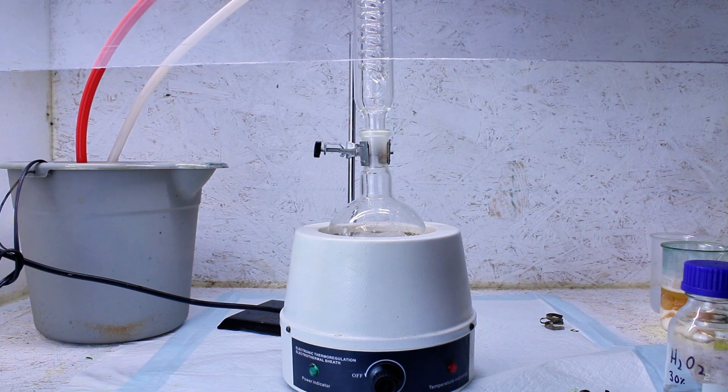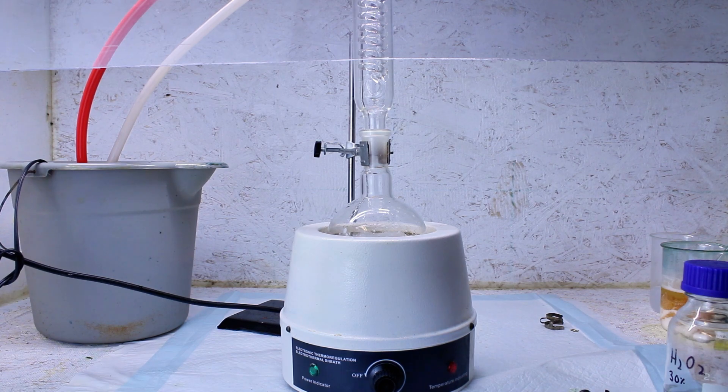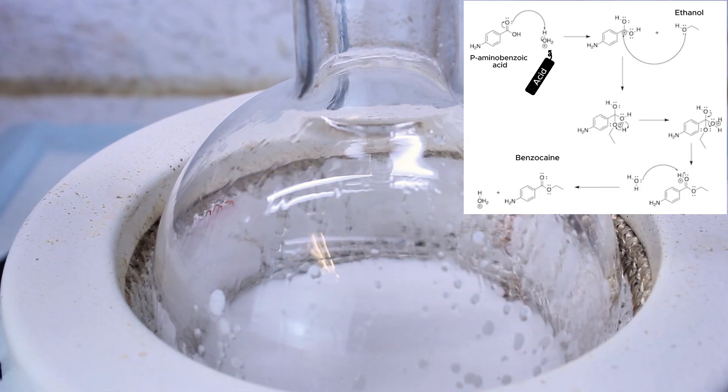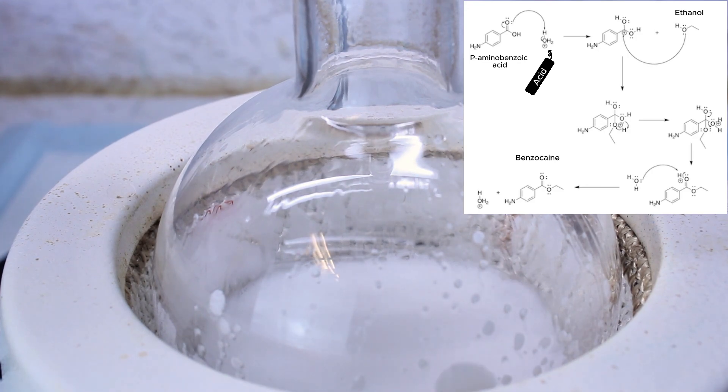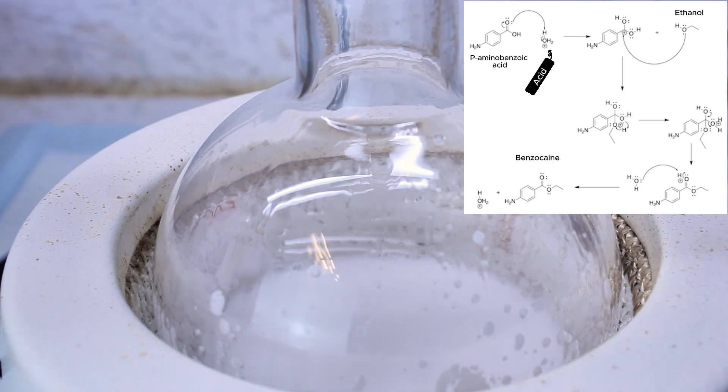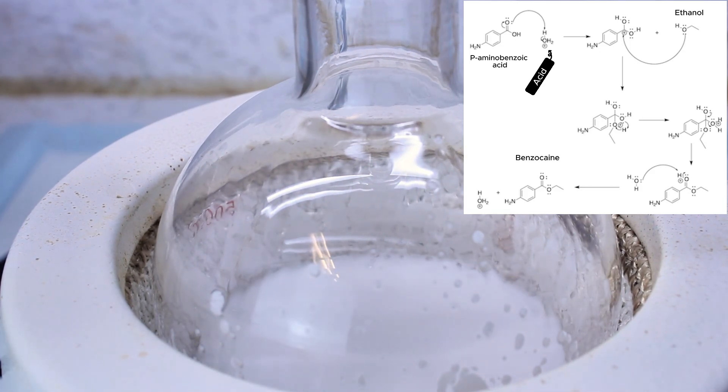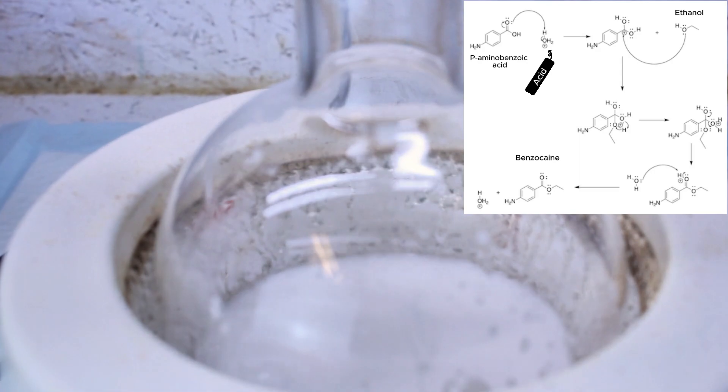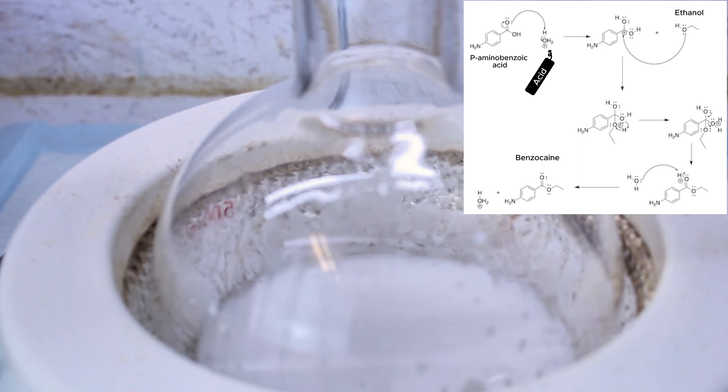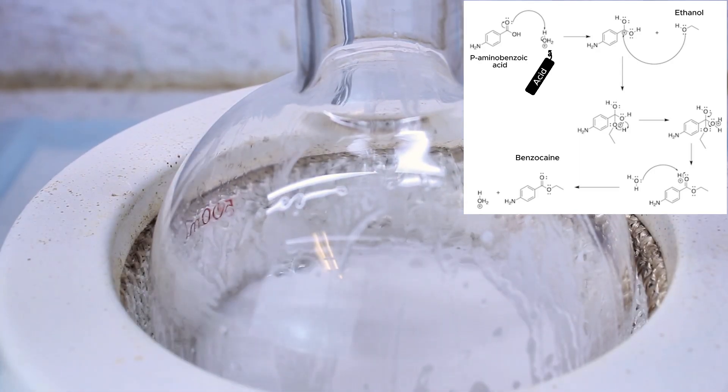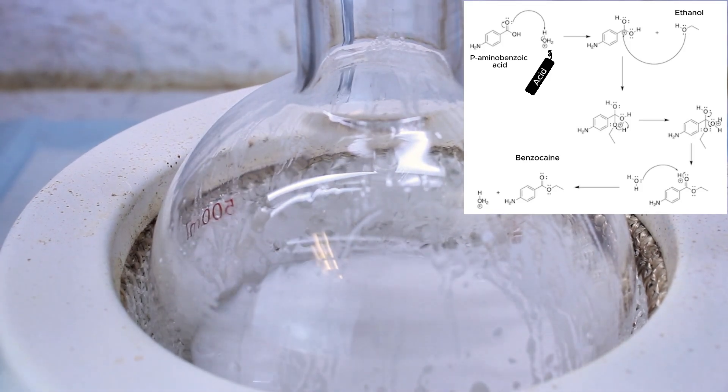What's happening now is the acid-catalyzed Fischer esterification between the ethanol and the para-aminobenzoic acid. In the first step of this reaction, the carbonyl oxygen is protonated by the sulfuric acid catalyst, activating it toward a nucleophilic attack from the ethanol. When this happens, a lone pair of electrons from the oxygen atom of the alcohol form a bond with the carbonyl carbon, breaking its pi bond to the other oxygen.